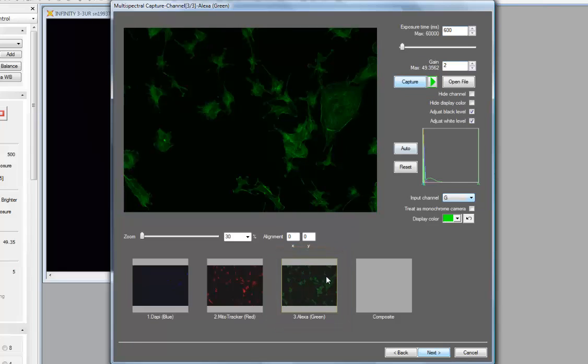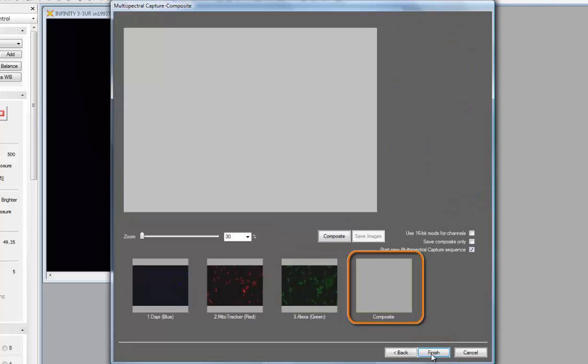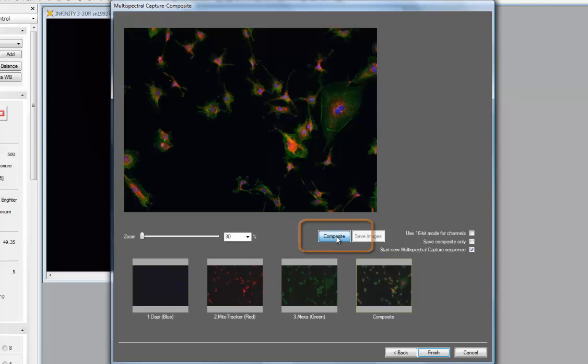Now, with my shutter on the microscope closed, there's no photo bleaching taking place. I've captured a blue, red, and green channel. The next step is to proceed to the composite by either clicking on composite, in which case the composite would be generated automatically, or clicking the next to display the composite, and then clicking on the composite tool, and my composite captured image is displayed immediately.